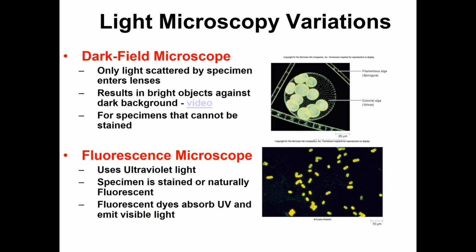All right, now, fluorescence microscopes are becoming just ridiculously common. You can specialize in this as a career choice if you want. But fluorescence microscopes rely on ultraviolet light. So instead of a standard light bulb, you rely on a UV light bulb.